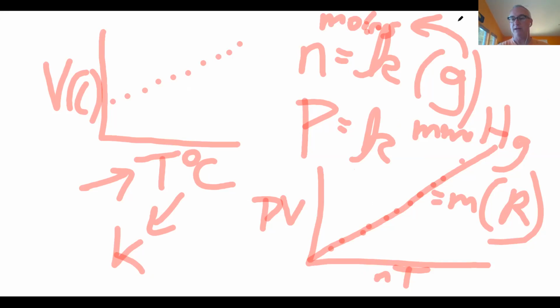And we're going to need to convert millimeters of mercury to what? What unit of pressure are we going to? Atmospheres, exactly. We're going to have to convert that to atmospheres. We're going to have to do a lot of math. The nice thing is you're going to be using either Excel or Google Sheets to do all that math for you, because it's a pain. It's like sitting with your calculator, punching in all these numbers. You don't have to do that.